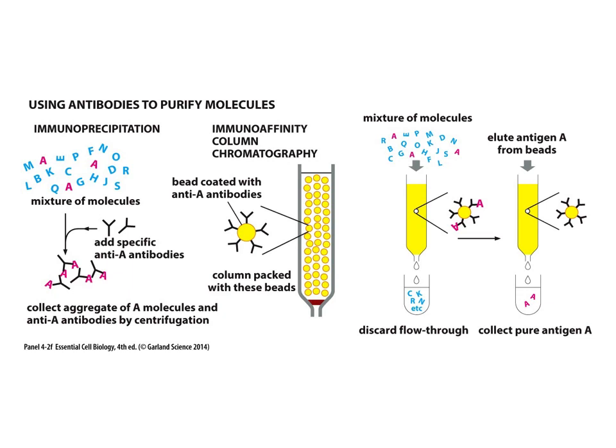Or maybe we're going to be using this sample with purified antigen as a vaccine, so we're then going to immunize individuals with it. So if we take this to a real world application, what we could do is take COVID, and we could infect respiratory cells with the COVID. That would grow up lots of the virus, right? So we could take the virus, we could homogenize it, so we would have viral lysates, if you will.